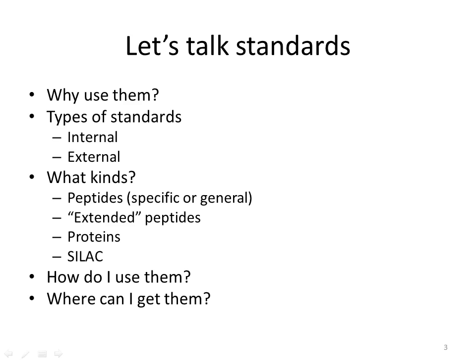So, how many of you set up quantitative targeted methods and do not use standards? It's okay, don't be shy. All right, why not? Haven't optimized, haven't selected what you want to go for? Same? They're in my desk. Okay. So for some, it's a matter of availability.